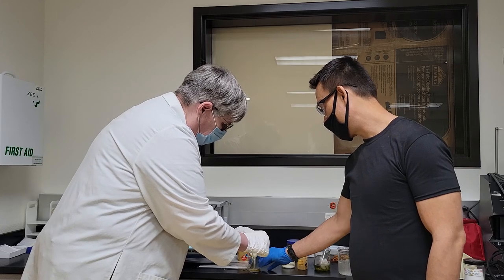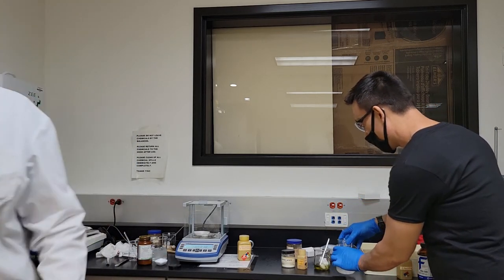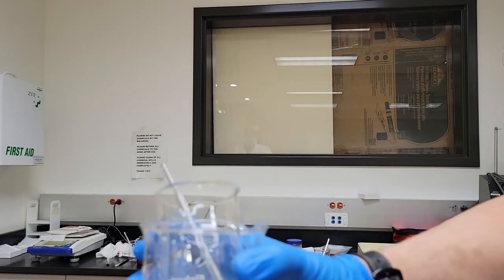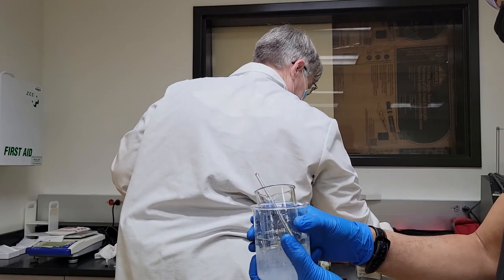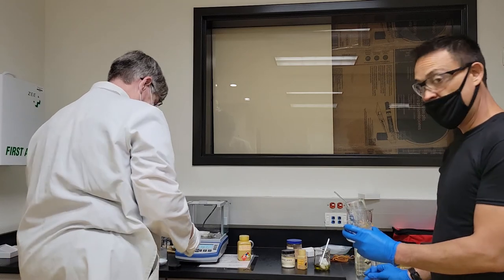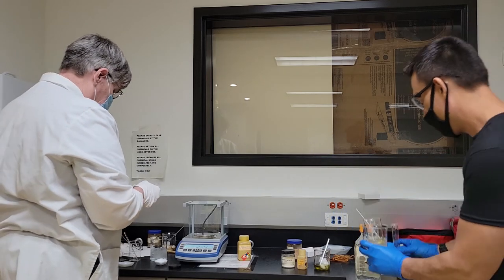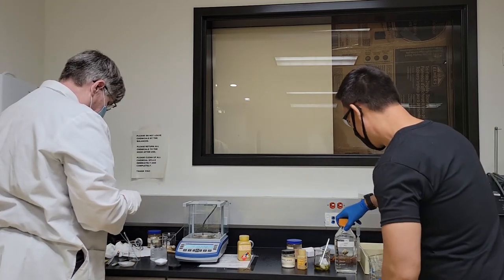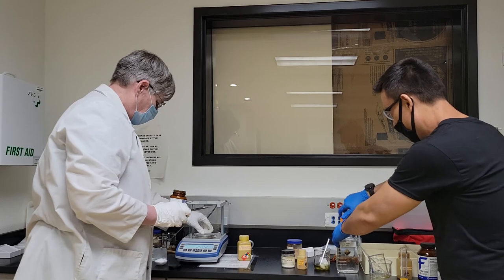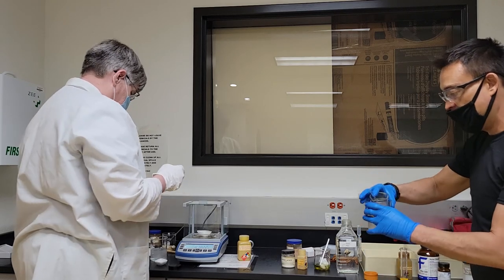We're not doing stoichiometry this week on this one. You're going to add the water and then 20 drops of concentrated hydrochloric acid — hold your breath. Just pouring some water in here and then the drops of acid. It needs about one milliliter, and then you need to ice it. It needs to be ice cold before we actually turn the aniline into a diazonium.